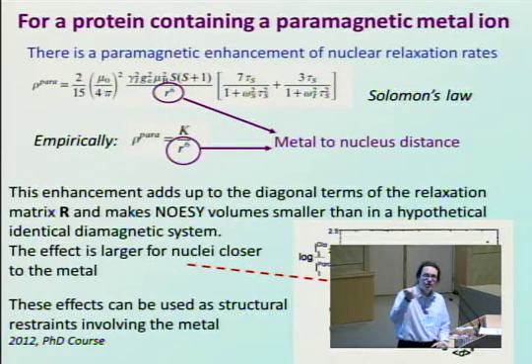And this time we are talking about the average distance between the two protons involved in the interaction and the paramagnetic center. And you can see this plot here, which tells you in logarithmic scale how much the intensity is decreased as a function of the average distance from the metal site. So at 4 angstrom from the metal site, this relates to a very specific protein, 4-iron ferredoxin, because the effect also depends on electronic properties.